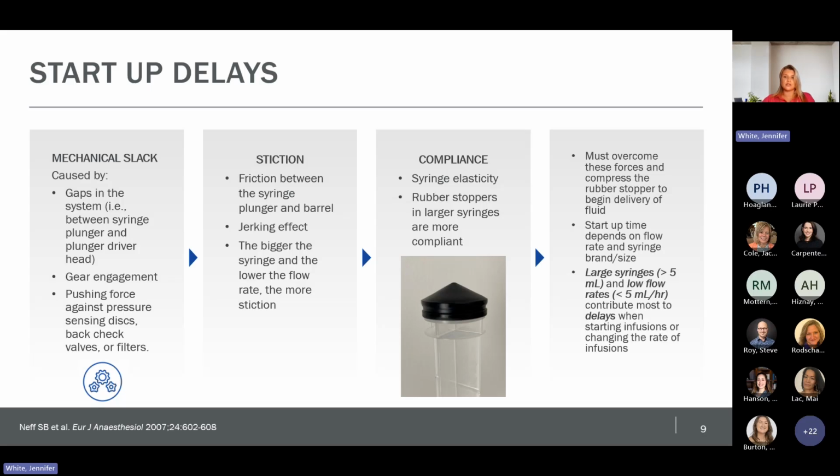For example, if the syringe is not properly loaded, there could be a gap between the top of the syringe plunger and the plunger driver head. So when the pump is turned on, it will take some time for the plunger driver head to come in contact with that plunger. This is why it's so important that the syringe is properly loaded into the syringe pump and is in contact with all the areas of the pump that it should be.